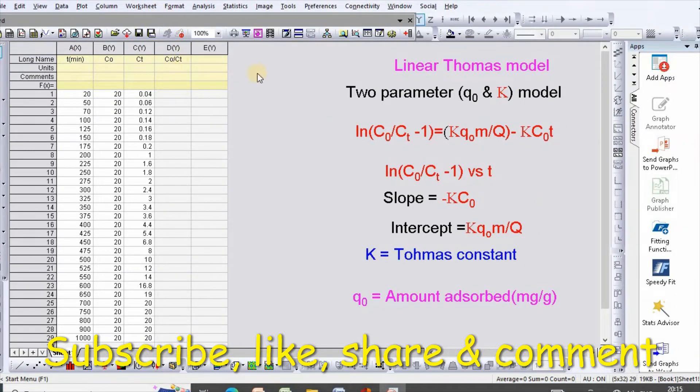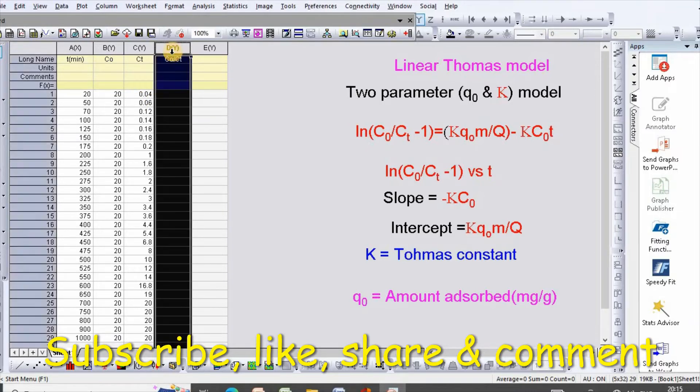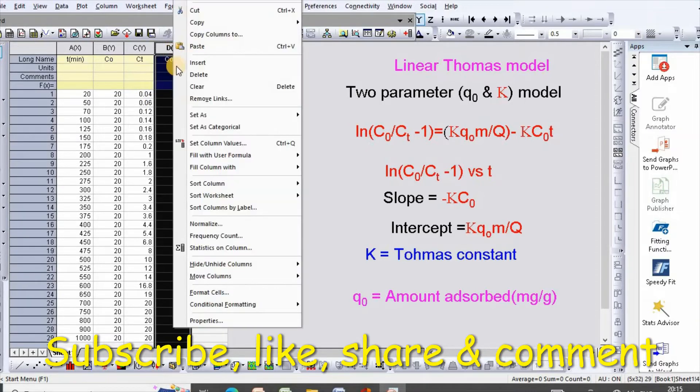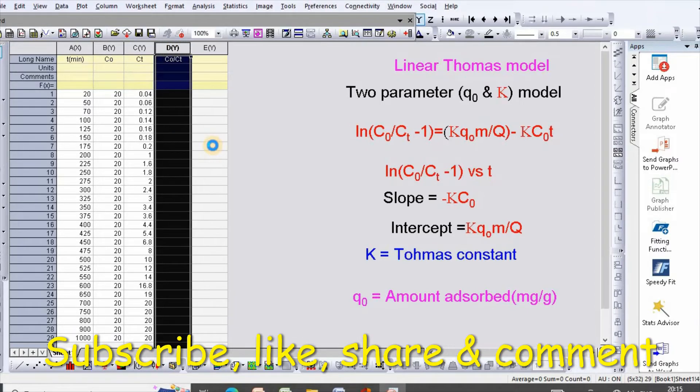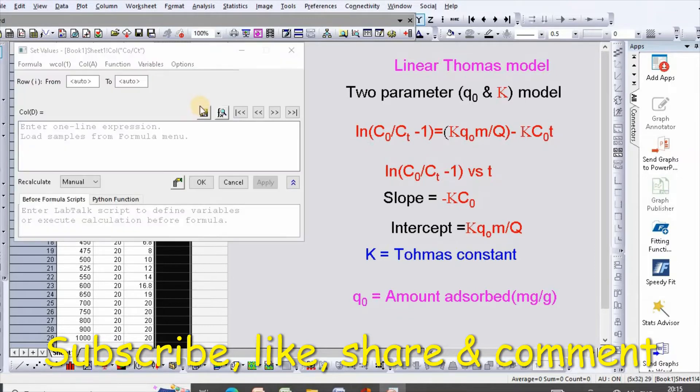Select this and right click, then set column values.